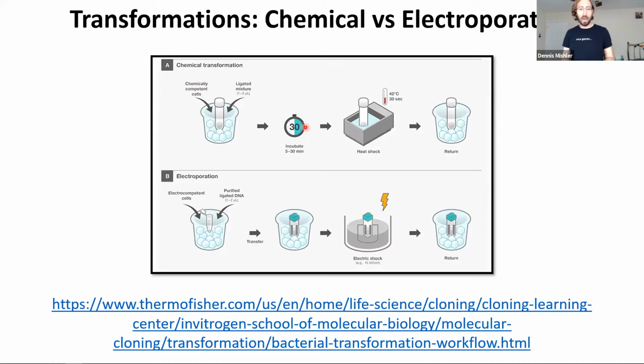You're going to get a water bath, warm it up, and then expose your cells to that for a little bit of time. In this particular procedure that's written out here, they went with 42 degrees Celsius for 30 seconds, but that can be varied. Depending on your procedure, you might use a slightly different setting, and that's okay. But after the heat shock's over, you're going to cool your cells back down. And then from here, you would go to the recovery, so you'd start the recovery process to let the cells grow and start to express your DNA sequence.